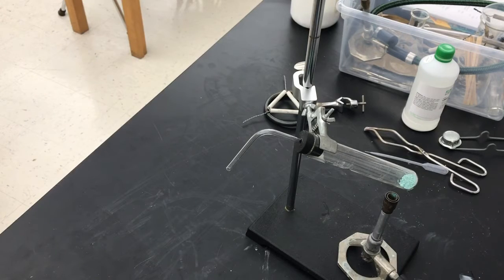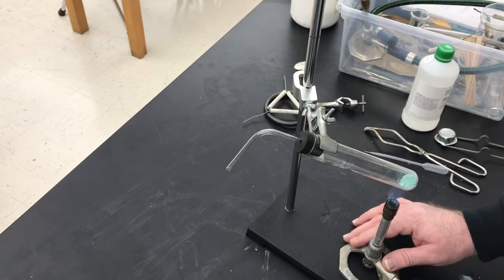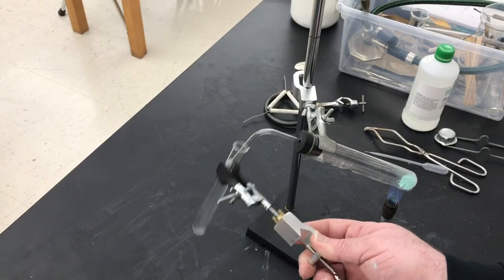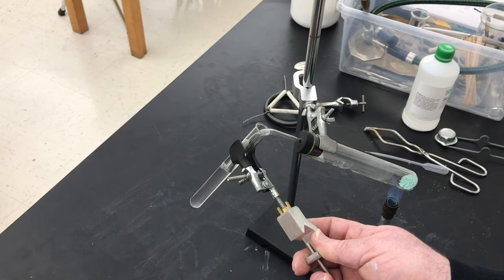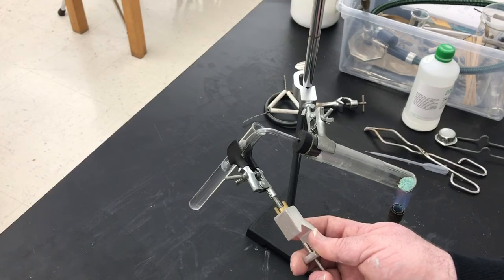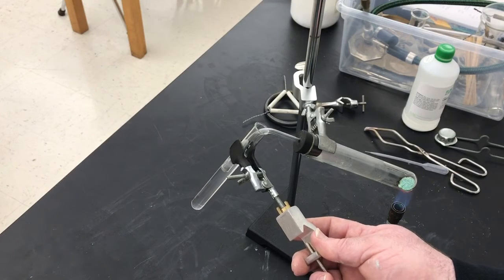So let me light the burner. There we go. And let this go for a little bit. And we'll get some bubbling here, but that first bit of bubbling probably isn't going to do anything just because you're essentially pushing out the air that was already in the test tube. So I'm going to let this keep going for a bit.